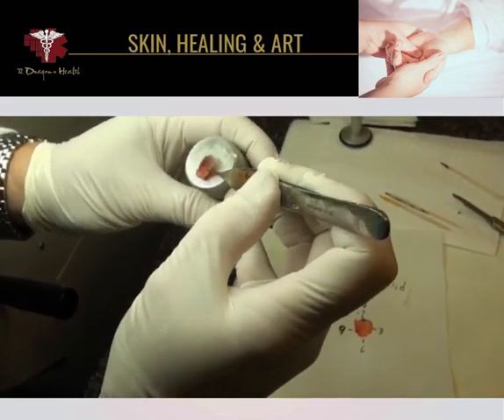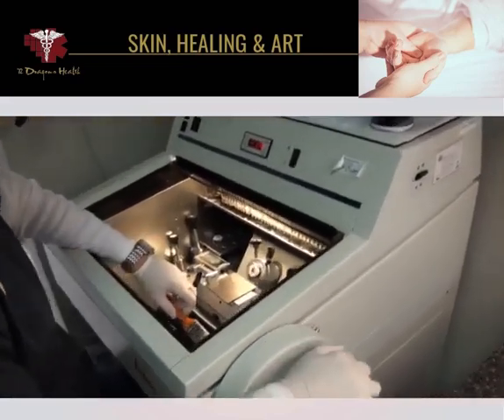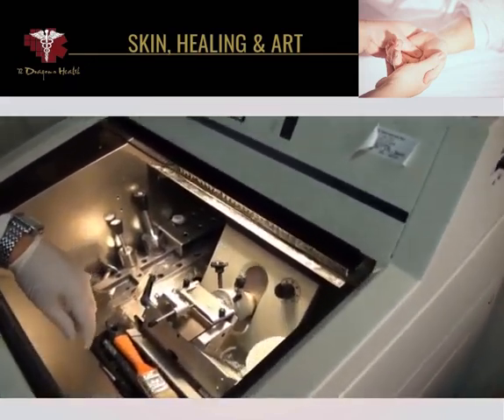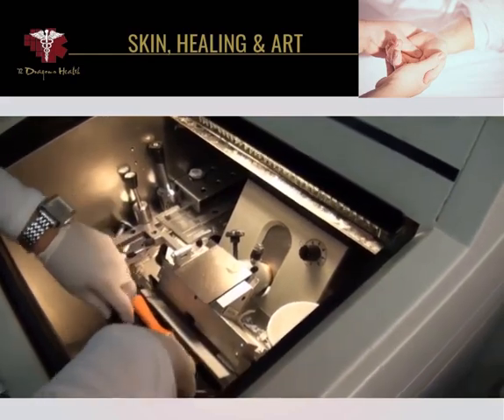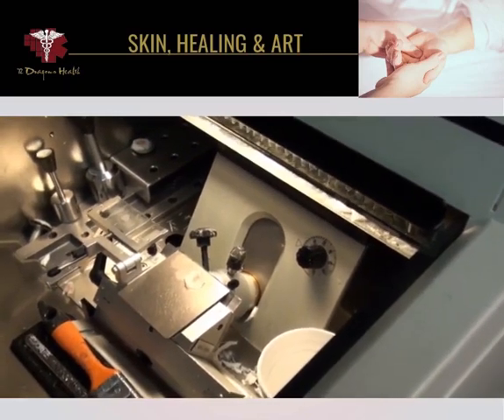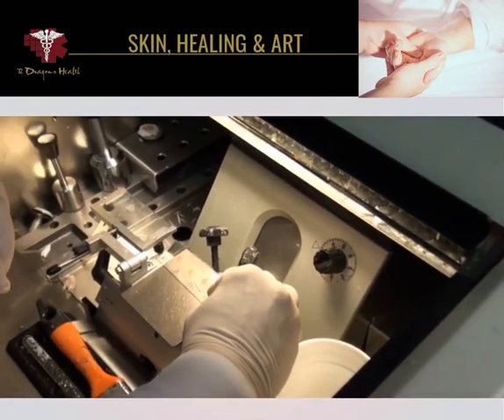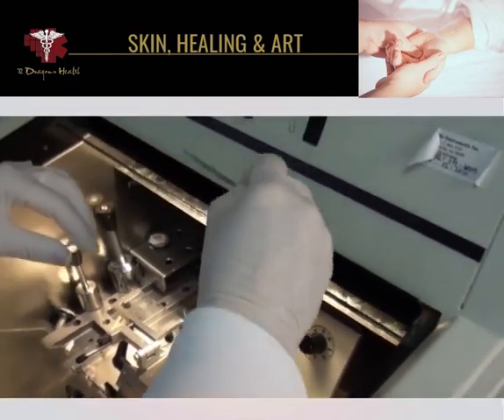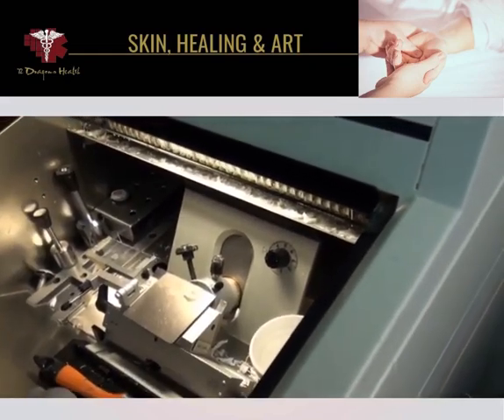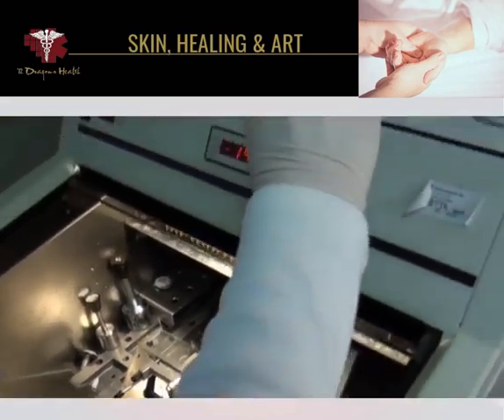The specimen is flattened and placed on the cryostat. The blade is cutting across the specimen, and the micro-thin sections are being picked up and placed on a microscope slide that will then undergo staining. The blade goes across the base of the specimen, it's picked up by a microscope slide, and then the slide is processed.